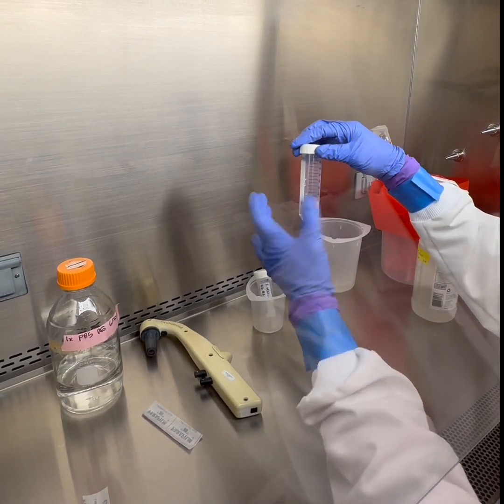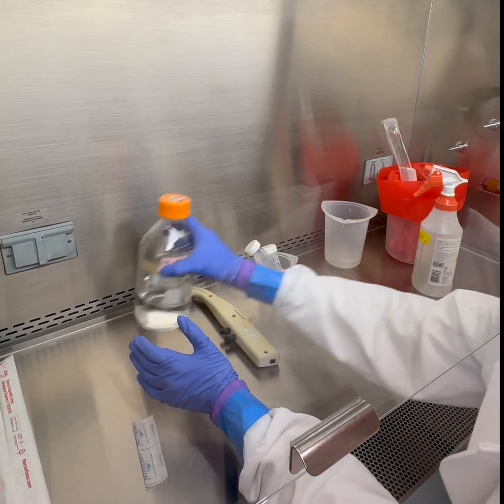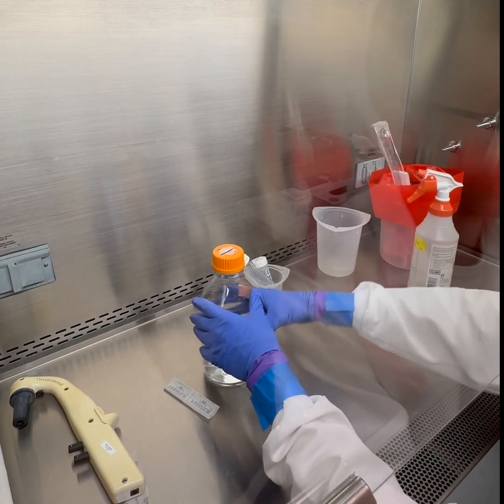So here I just have PBS. I'm going to grab a little bit more just because I like to do about 25 milliliters per wash. You could do less, you could do more, it doesn't really matter.